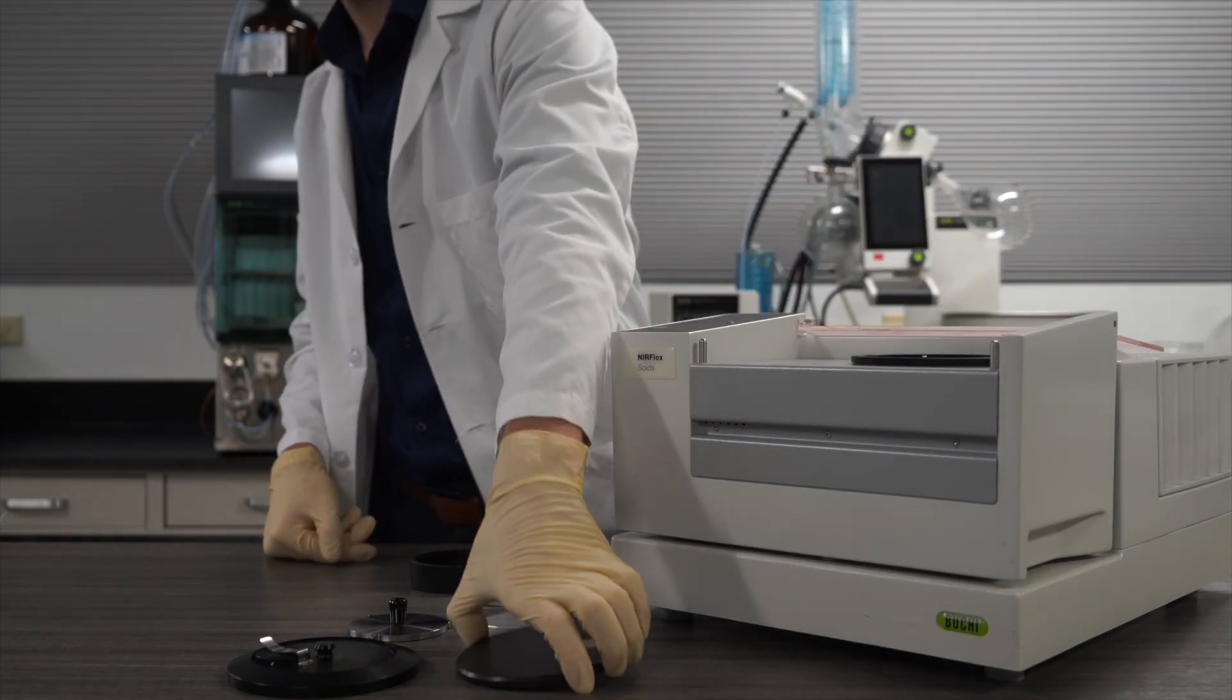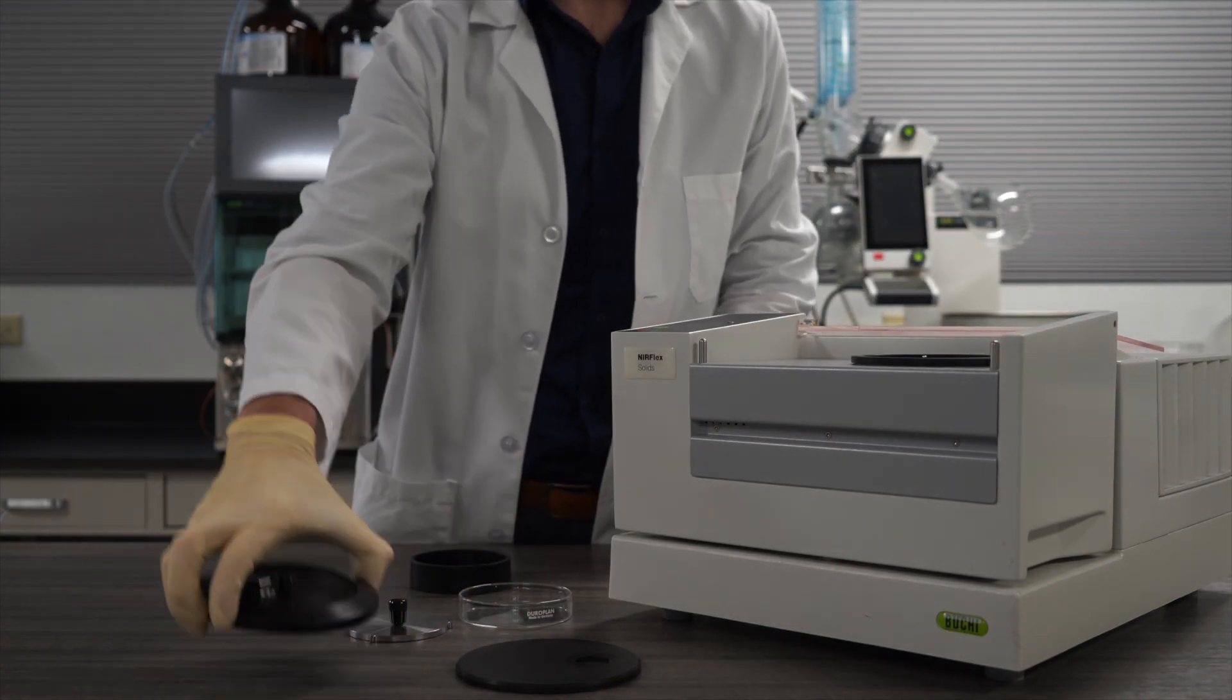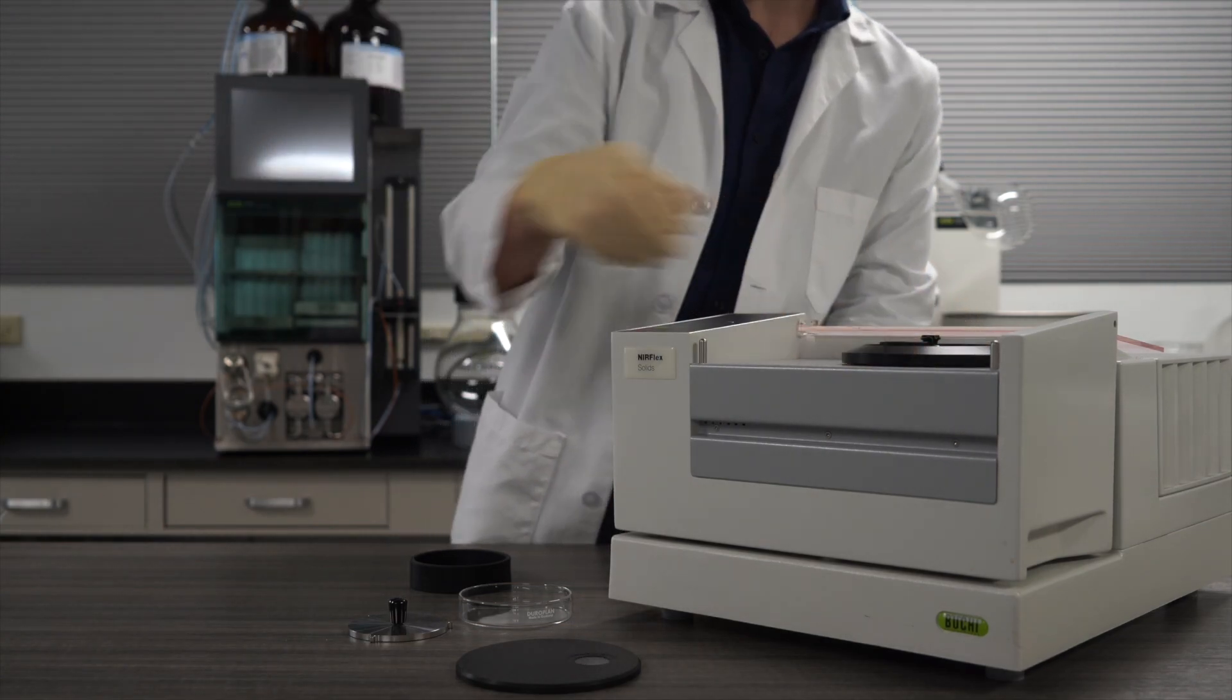For those needing higher sample throughput, there is also an option for a six-position auto-sampler for measuring materials in glass vials.